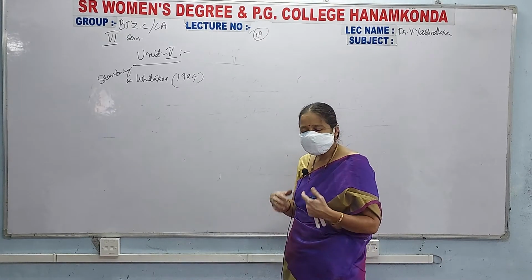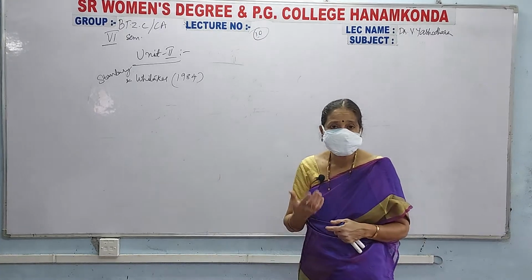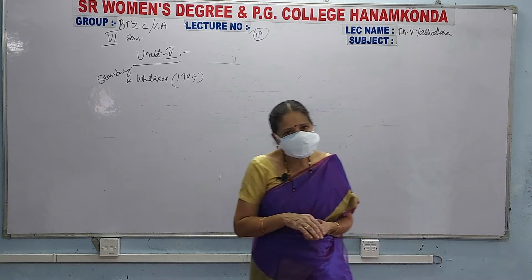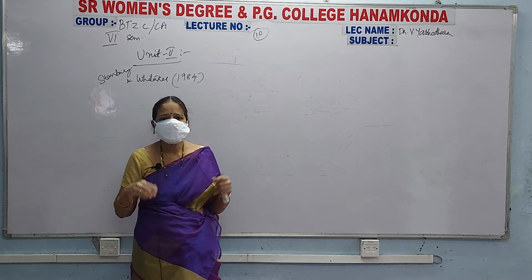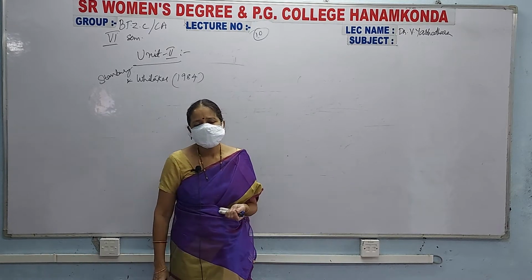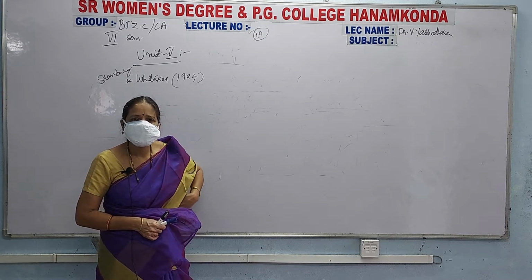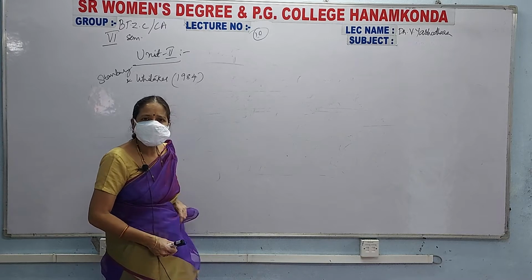ఈ ప్రోడక్ట్ మనకి ఎక్కువ కావాలి అంటే బయోరియాక్టర్ని ఎలాంటి దాన్ని మనం డిజైన్ చేసుకోవాలి అన్నది ఈ స్టాన్బరీ అండ్ విటేకర్ 1984లో చెప్పారు. సేమ్ వాళ్ళు చెప్పిందే ఇప్పటిదాకా కూడా, వాళ్ళు చెప్పిన ఐడియల్ బయోరియాక్టర్స్ వాళ్ళు చెప్పినట్టే కన్స్ట్రక్ట్ చేస్తున్నారు. For the construction of an ideal bioreactor, the rules and regulations were given by Stanbury and Whittaker in 1984.